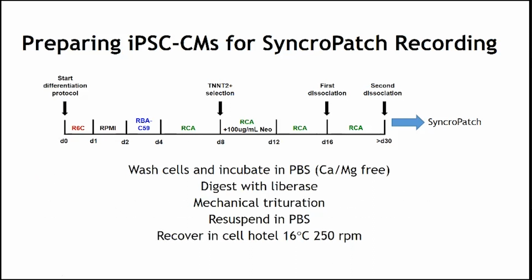Another thing, when we prepare the cells on the day of recording, here is the protocol for that. We clean the cells with calcium and magnesium-free PBS. We digest the cells with an enzyme called Liberase. They're very gently triturated, and then they're suspended again, placed on the Cell Hotel, and then we let them sit in the cold for about 30 minutes before they're recorded.